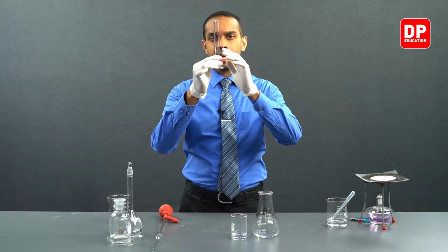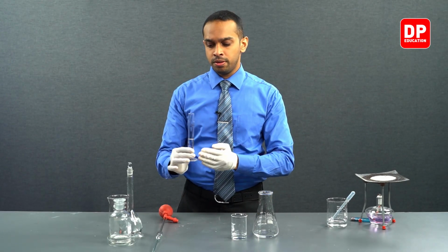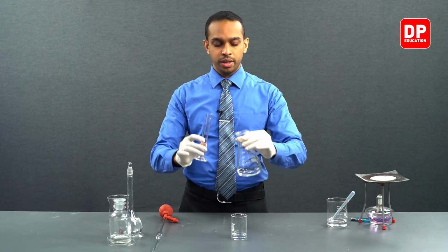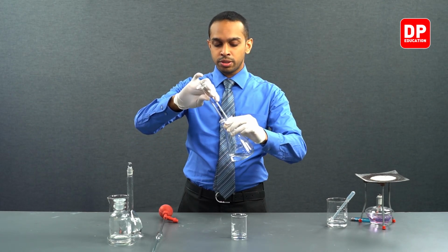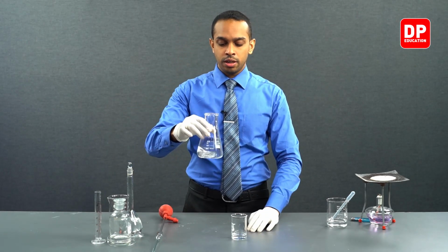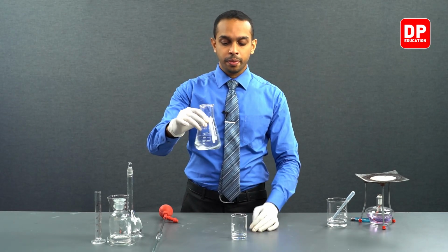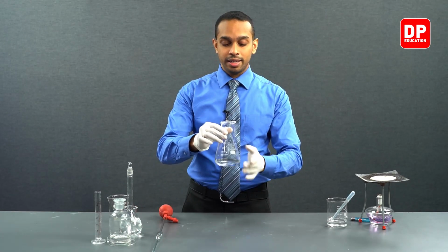After you measure exactly 15 cubic centimeters of dilute sulfuric acid, we can transfer it into our potassium oxalate solution over here. And now we will give it a little swirl. We'll swirl the solution around a little bit, and then we have to go ahead and heat this solution.